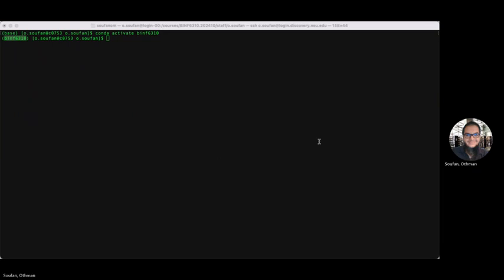So all I want to do is define a path. Let me first do it this way. I'm going to call the program, and then I need to give it the FASTQ file. This is under courses, data quality.